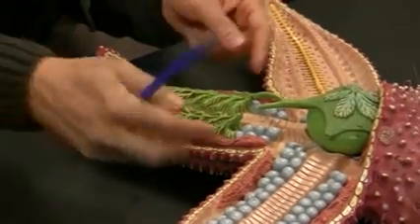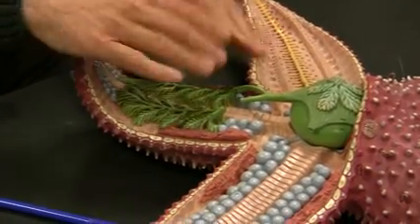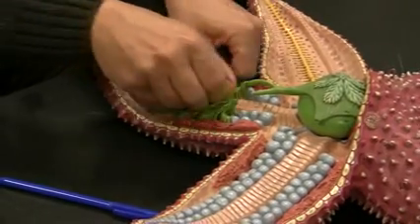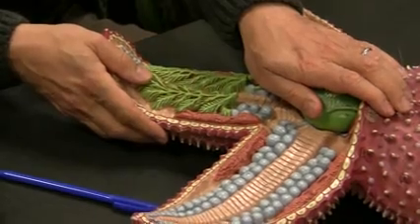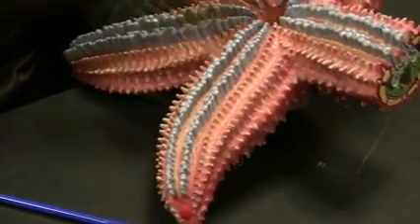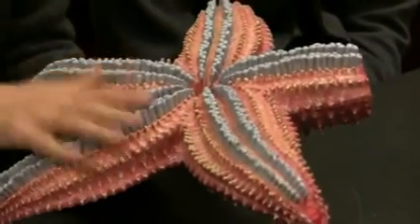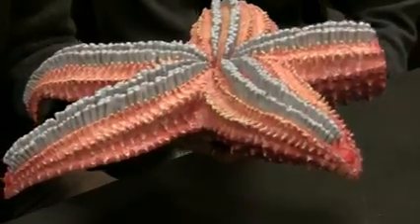Underneath of these are gonads. If you dissect from top to the bottom, the first thing you see are these. This is the top of the animal. We call it aboral. Since the mouth is here, we call it oral. Just like jellyfish, we don't call it dorsal and ventral because these are radial symmetry animals. We call them aboral and oral.